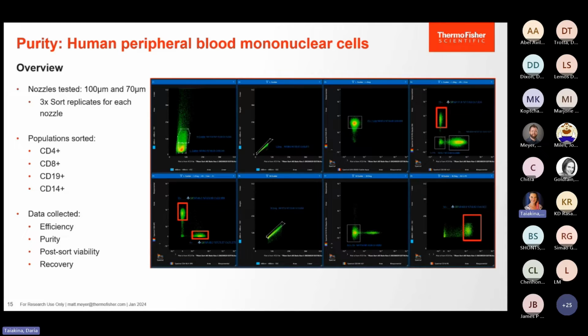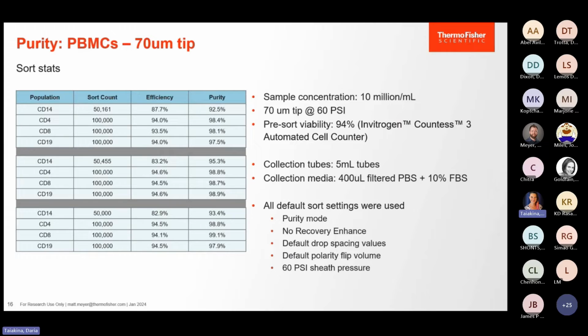And when we collect this, we also measure some of the more important statistics as well. This is a summary table from the results on the previous slide. The purities typically average 98% or greater, and we actually run this test in manufacturing and integration as well.